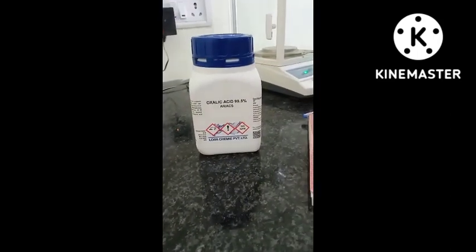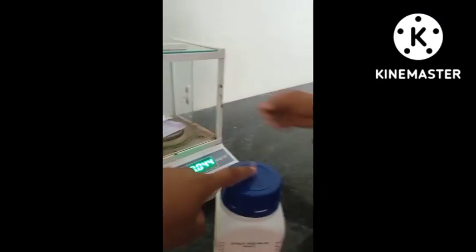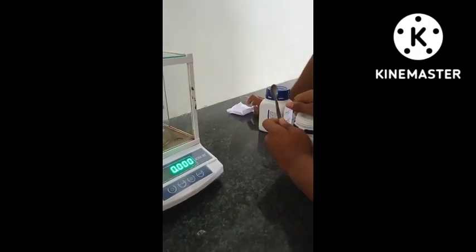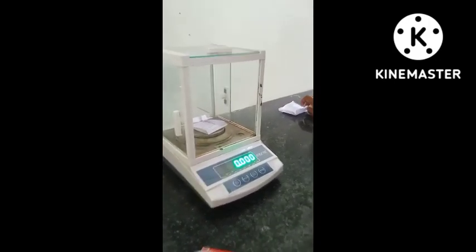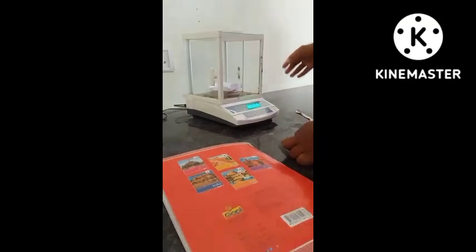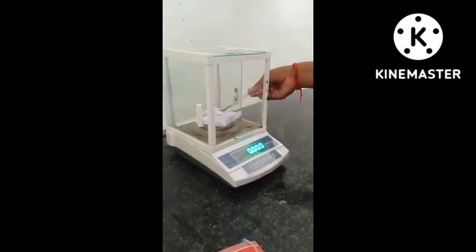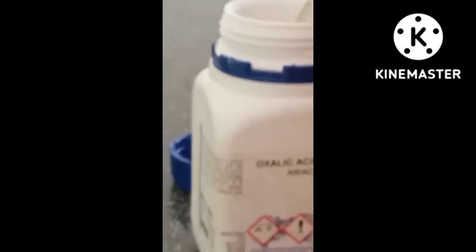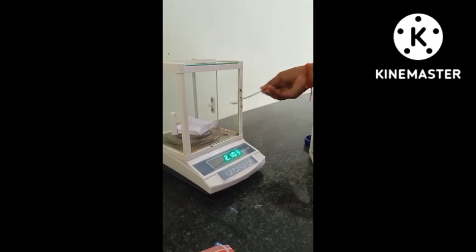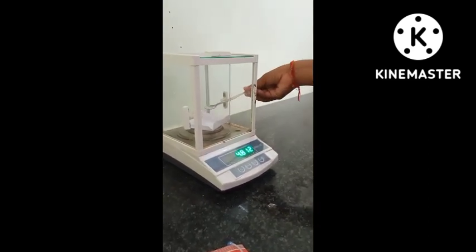So this is oxalic acid, which has 99.5% acid in it, and now we are going to measure 4.5 grams, because 4.5 grams of oxalic acid, which is in powder form, is added into 1000 ml of water, and that makes the perfect solution. We are following the same process for 2 grams, as per our readings, we have to do all those things.